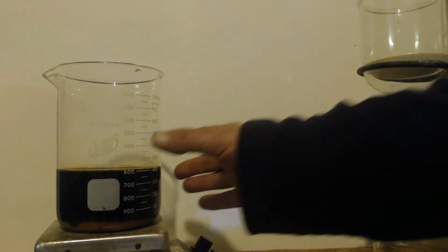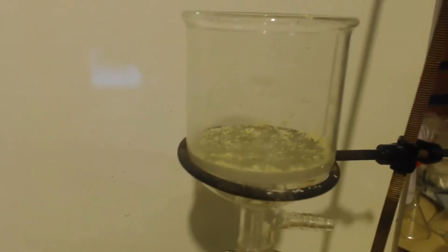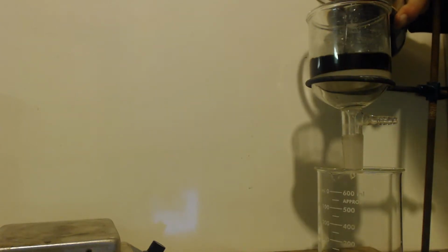So all I care about is that it's above 8. So it's good. I noticed there's a bunch in the thing here. I don't know if you can see it. So I'm going to pour it through there. And, you know, whatever hasn't reacted by now isn't going to react. This way, whatever's in the funnel can react, hopefully. And whatever ain't reacting, I can get it out of here. So I'm just going to let this gravity filtrate, and I'll get back with you.